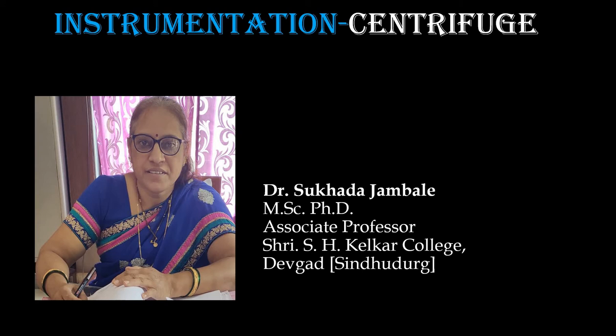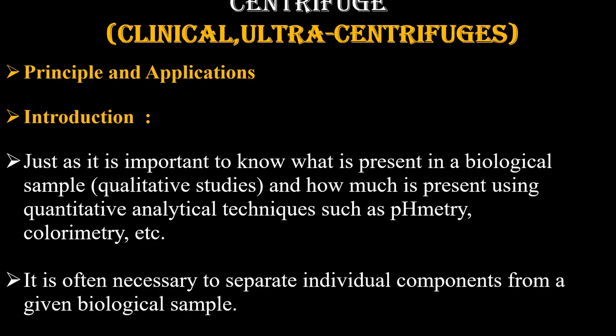This technique plays a crucial role in biochemistry and biotechnology as it is an indispensable part of one step or another in every method involved in biological study, right from separation of cell organelles to complex experiments involving separation of even subcellular fractions. So we'll consider two types of centrifuge in today's lecture, clinical and ultra-centrifuges.